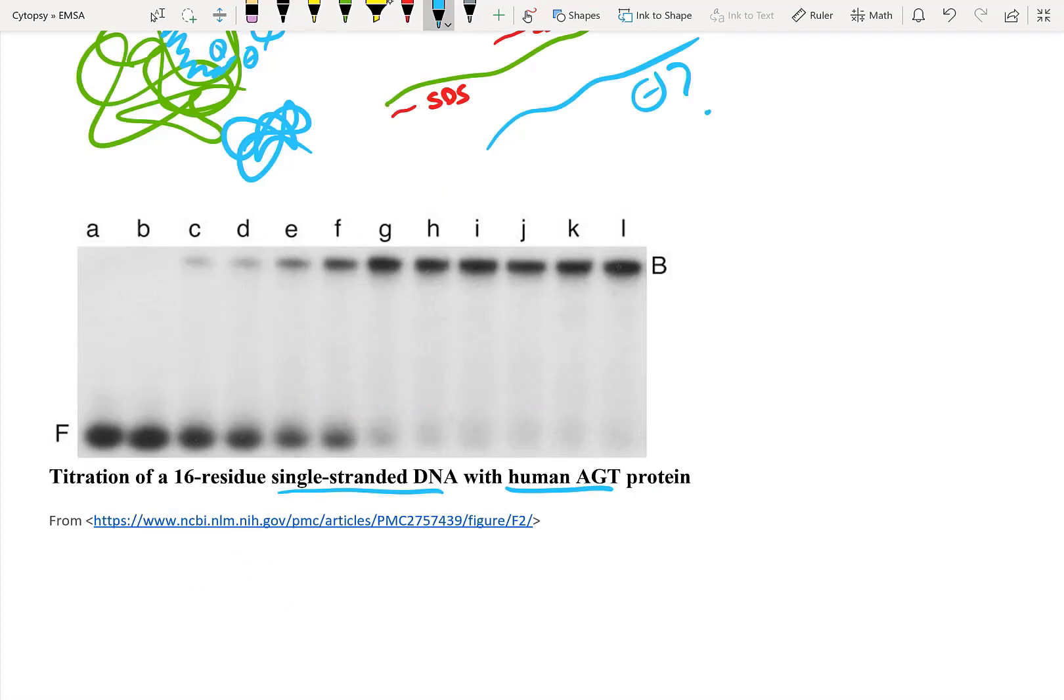What we see in this picture is a titration where we're slowly increasing the amount of protein over the course of all the different lanes. Here we've got very little protein and you can see there's not much binding to DNA. Here you can see almost all the DNA bound to the protein and formed the complex. It's only a little bit of free DNA here at the bottom. That's how the EMSA works, and this is why we do a titration to find the optimal amount of protein so that we can actually bind all of our DNA.